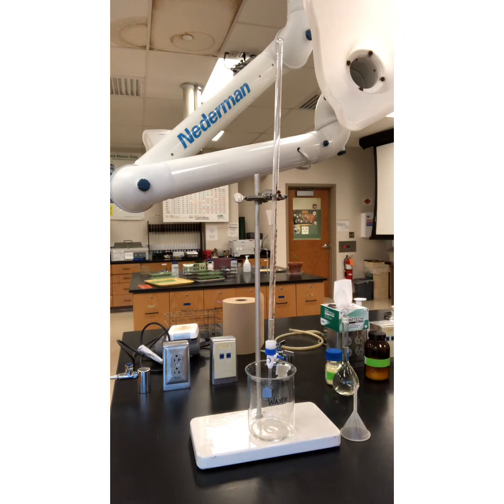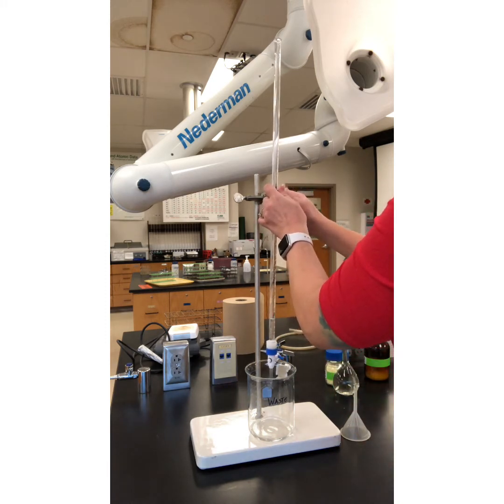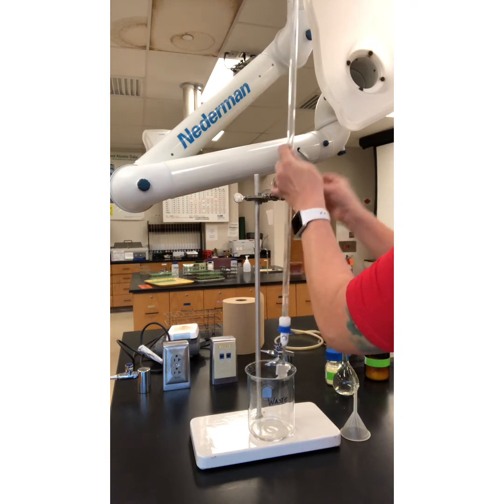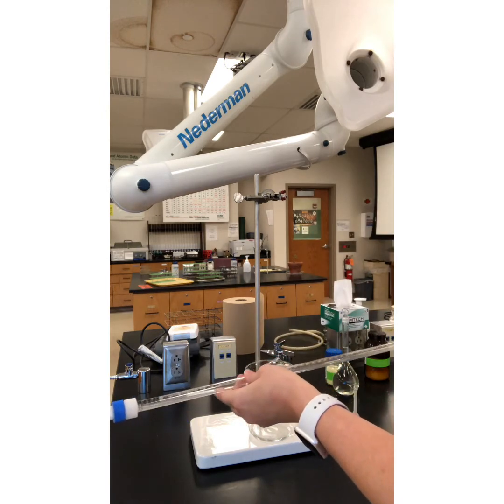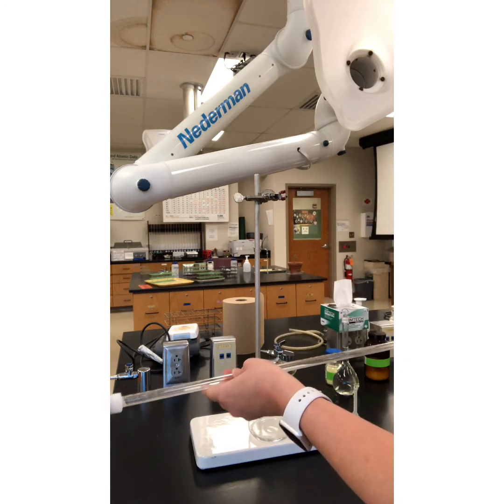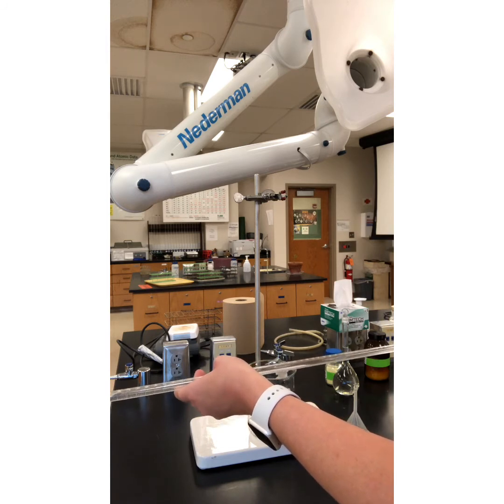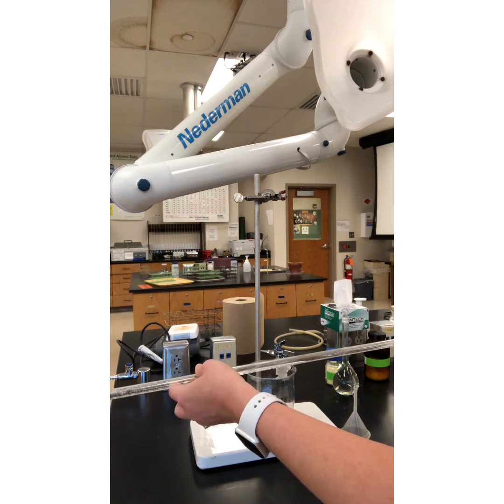Okay. So now I'm going to swirl it. I just got this perfect. Loosen my clamp. Set my burette free. And go ahead and allow the solution to run out here without pouring it out the end of my burette.